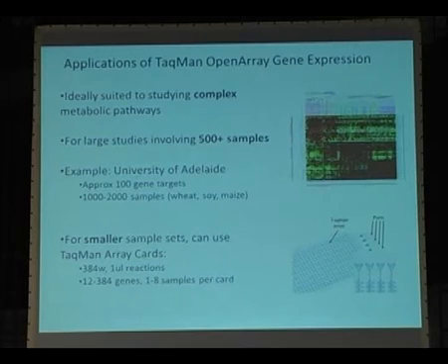However, you may not have such a grand-scale project, you might be thinking, maybe only less than 100 samples. And for this situation, we can do a similar kind of approach, but not using the Open Array platform, instead using something called a TaqMan Array card.